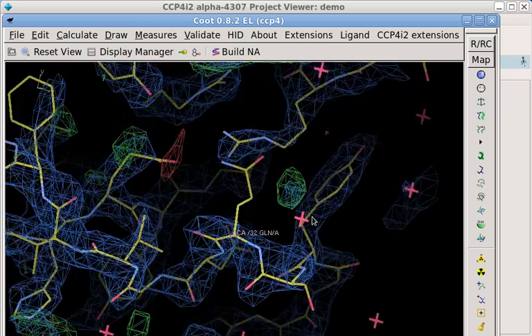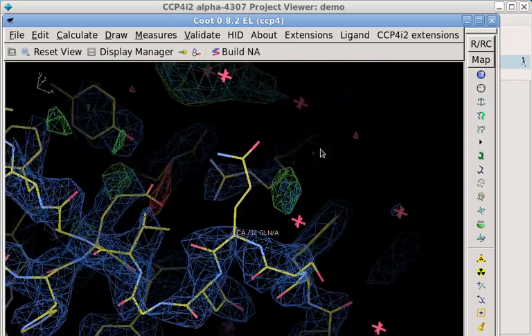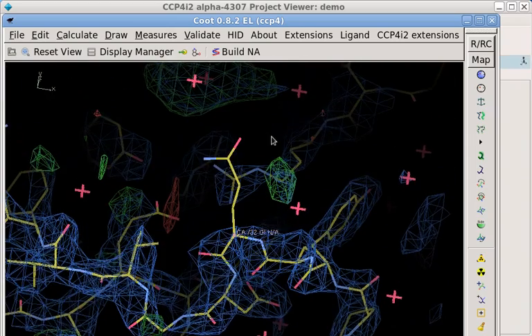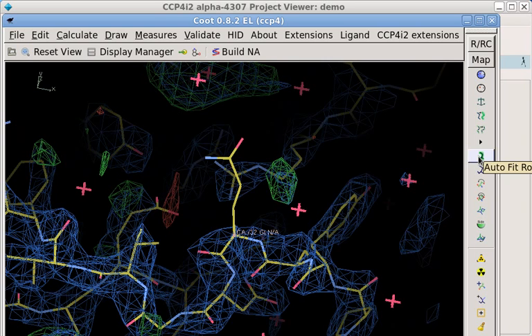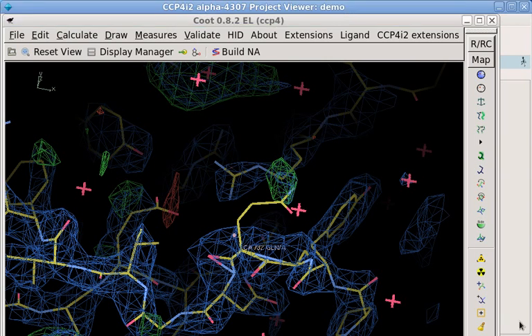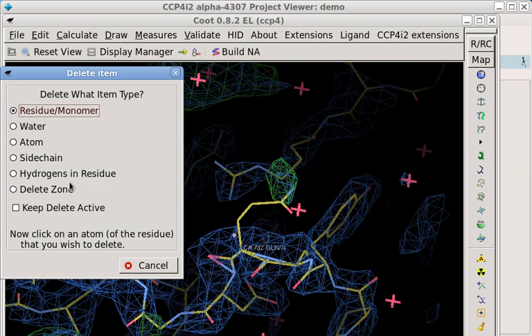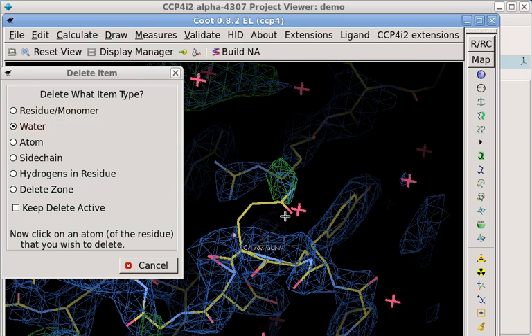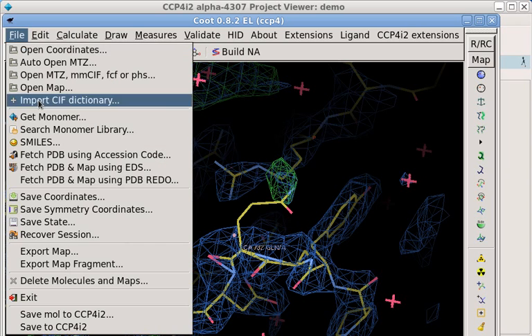For example, this sidechain conformation looks wrong. Once we fix that, a water needs to be deleted. When we've finished editing the model, we need to save it. Instead of using the normal File menu, we'll use the Save option in the CCP4i2 Extensions menu.